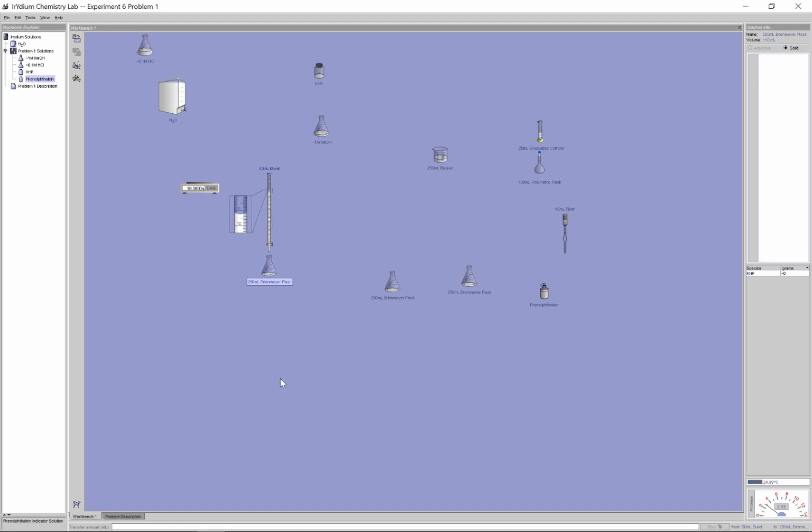Usually when you do a first trial here, it's just an approximation because, again, I may not know that this is about 1 molar. In this case here, I actually do. But what I'm going to do is just roughly estimate here. I'm going to pour in a couple here. I'm at currently 11 point something. Maybe I'm going to drop in maybe 1 milliliter at a time.